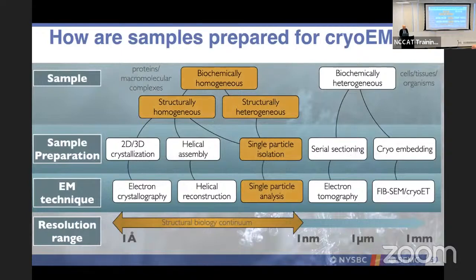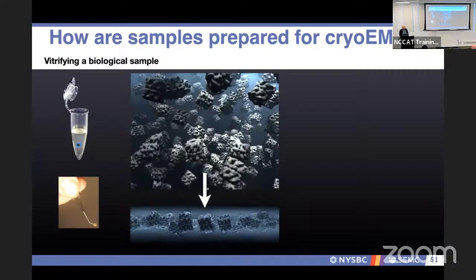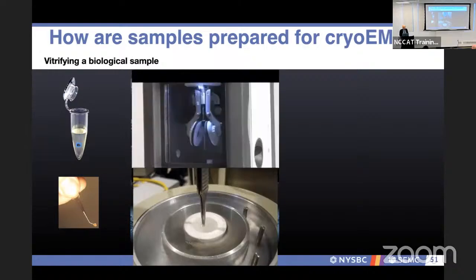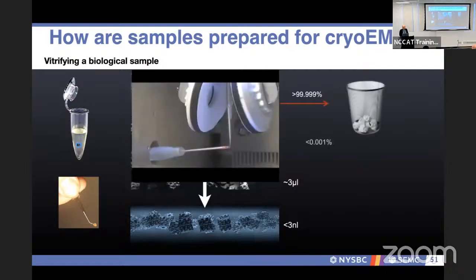But we're going to focus, again, since the scope is single particle, on the single particle SPA analysis. And you all did this yesterday, where you took something in bulk and tried to thin it down, probably through blotting, to get a very thin, homogeneous sample.